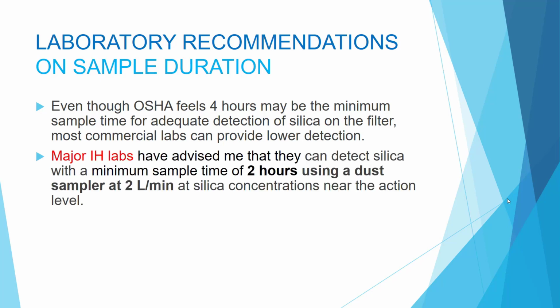Also keep in mind that the PPI is available in flows of 4 or 8 liters per minute if you wish to sample a shorter duration.